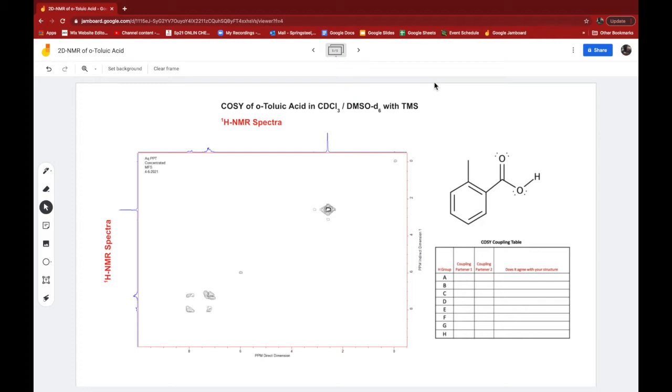Initially, we have to notice that this is the regular proton NMR, and it's got its scale down below. Here's the other 1D proton NMR scale over here. I blew it again. I cut off the acidic OH. I think it's because it cuts it off by default since it doesn't have a correlation, but I like to see the lack of a correlation. My mistake. Rusty. That's okay.